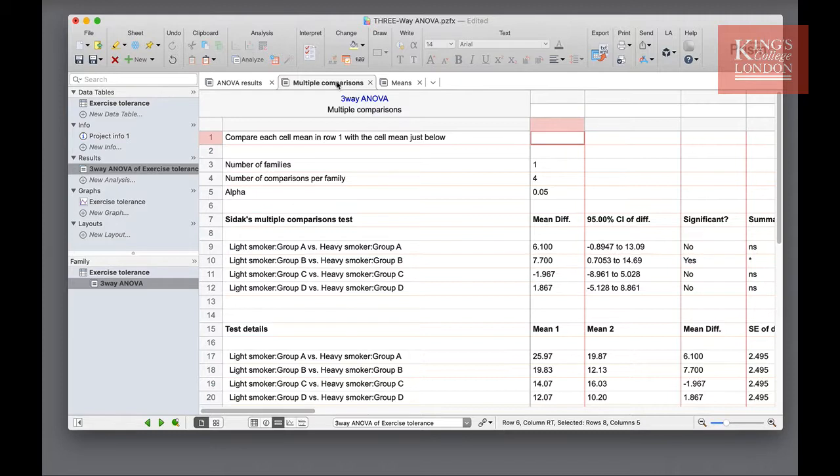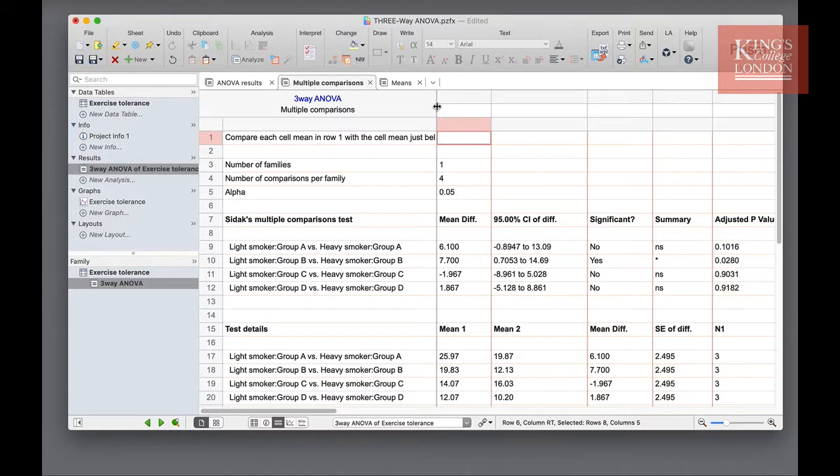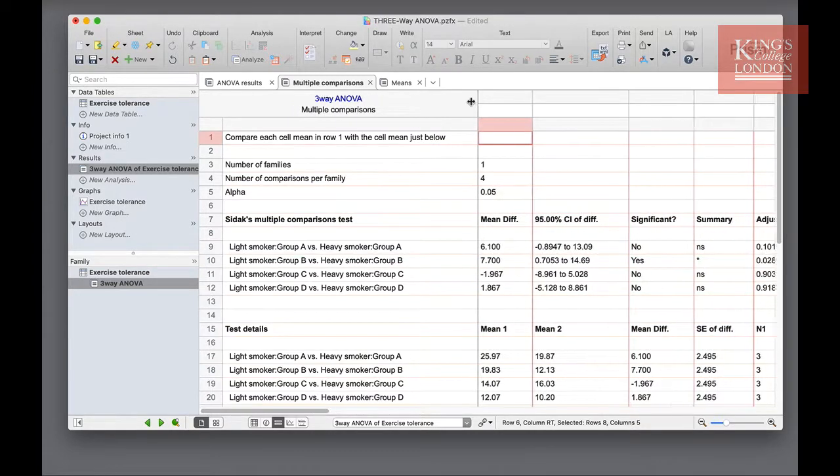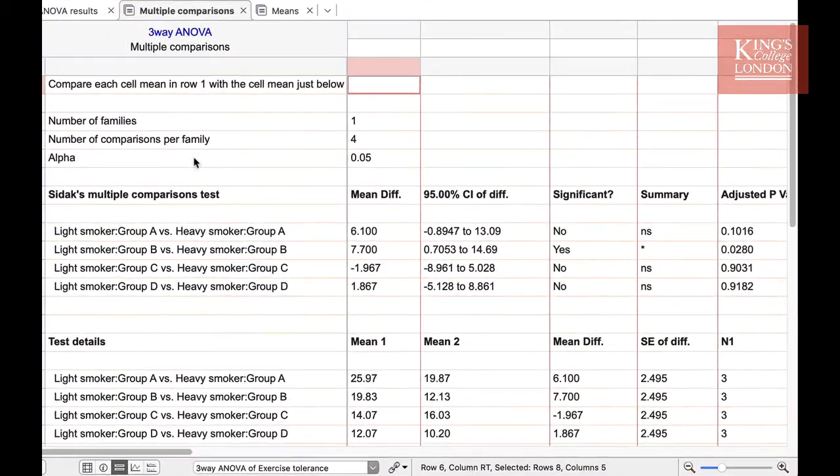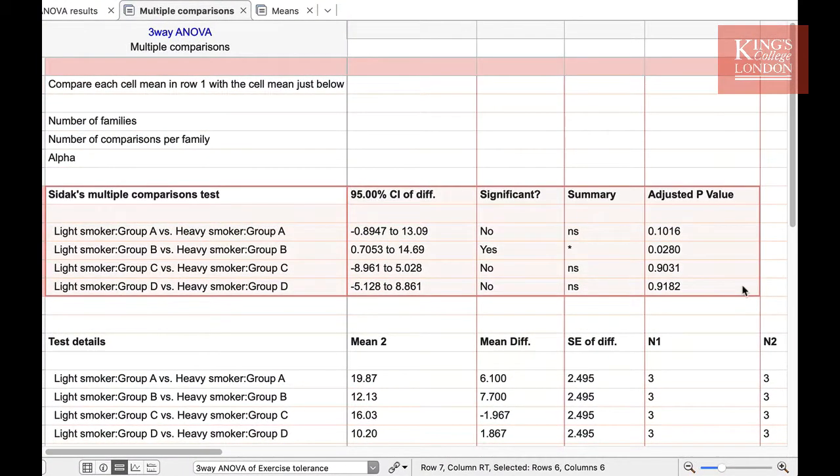Since my main interest in this study, as I stated at the start, was whether smoking had an influence on the outcome, I limited my multiple comparisons to compare light versus heavy smoking in each of our groups. If I resize this window, you can see the summary of the data listed in the table below, which I've highlighted.